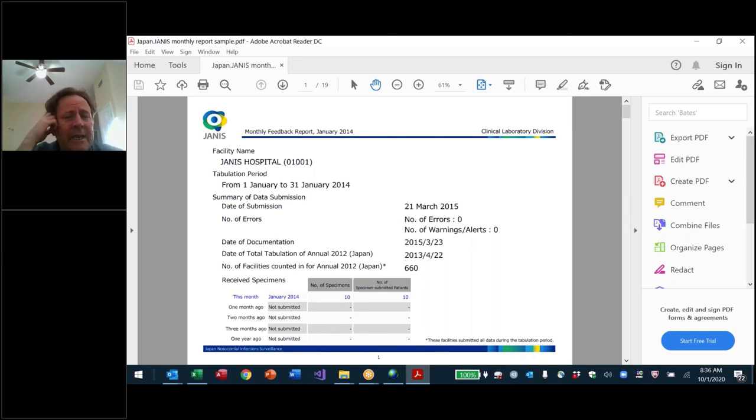You can either load in aggregate statistics. This is basically what GLASS does. You're not submitting isolate data to GLASS. You are submitting your percent MRSA, number tested. So into these web platforms, you can either submit your isolate-level data and have the web platform analyze the data itself, and that takes a lot of expertise. That's what Vietnam is doing. Or alternatively, you can submit the aggregate statistics to the web platform and display them. And then what Geneva does with GLASS, well, of course those data are not yet available to the public, but eventually they will be.